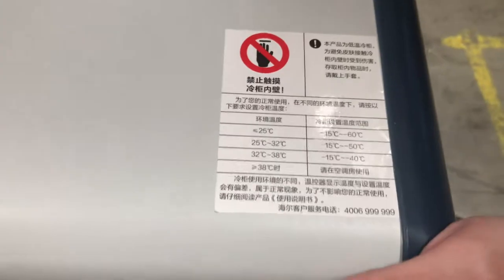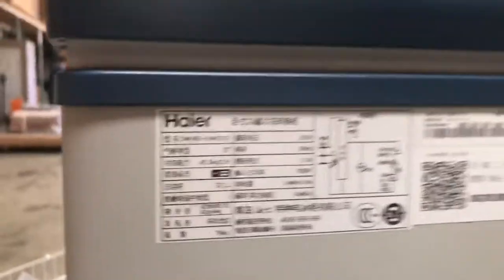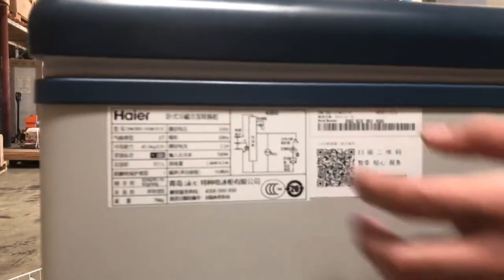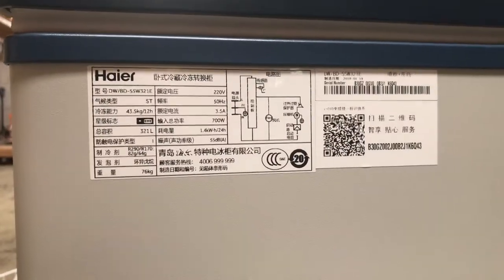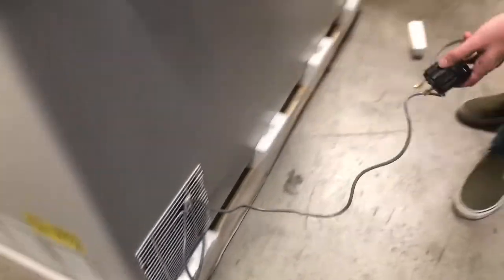The unit can run from negative 15 Celsius up to negative 60 Celsius. On the side of the unit you'll locate more information on this freezer — for example, your amps, hertz, voltage, all the electrical info you can locate right there on the side. This unit is going to run on 220 voltage, so you have your 220 plug right here in the back of the unit.